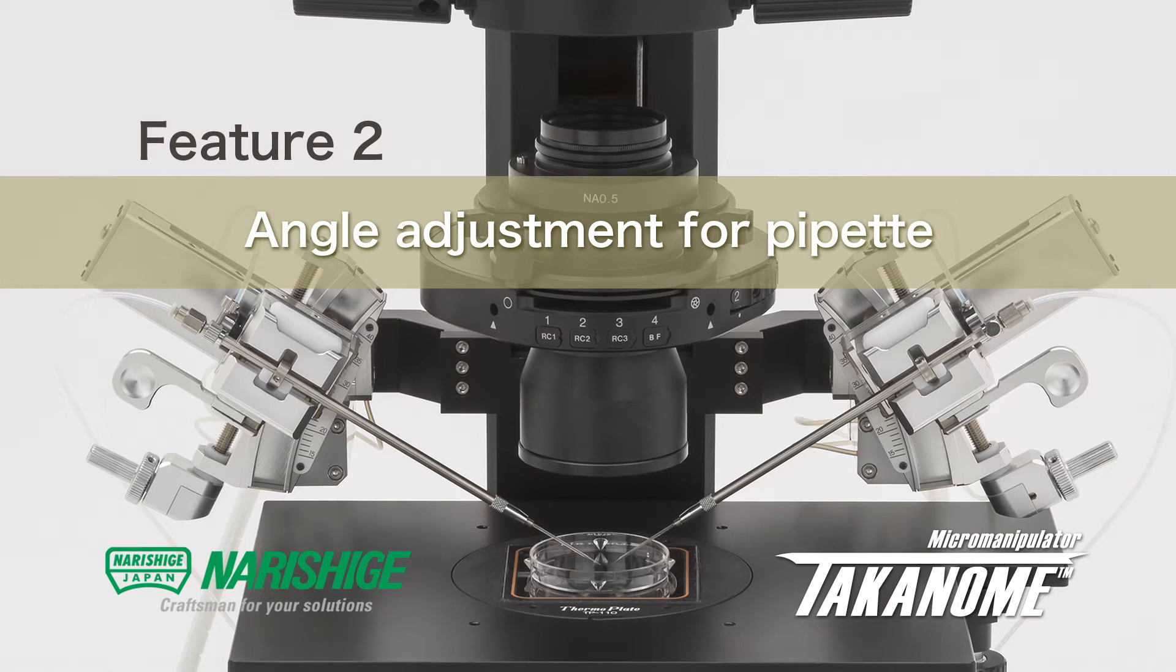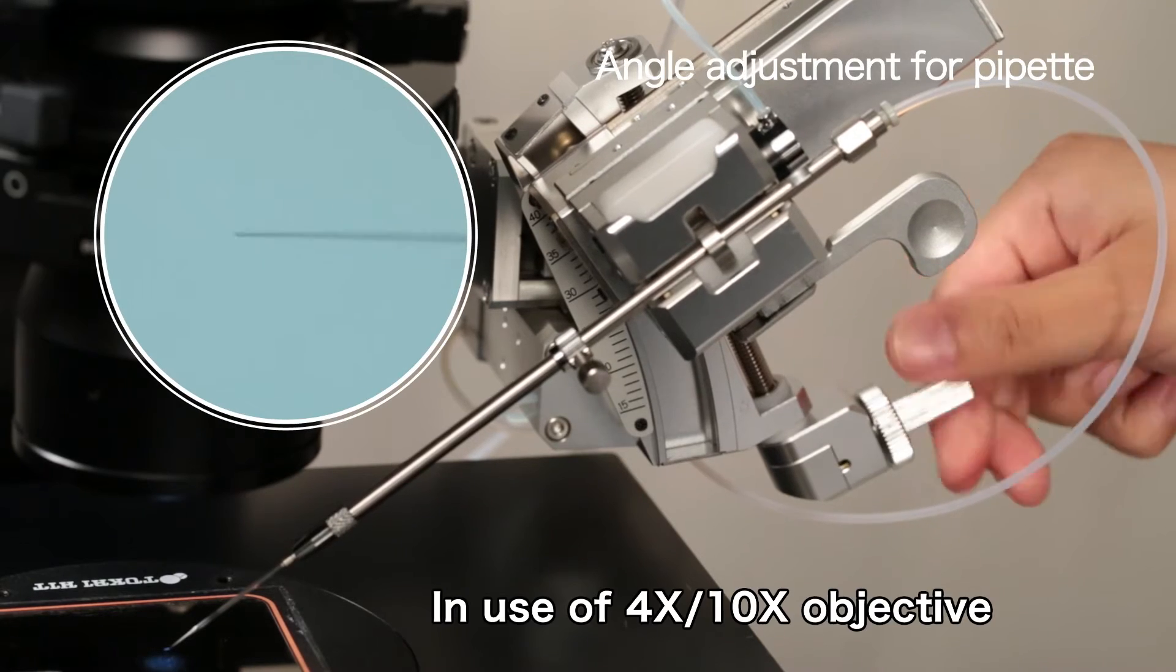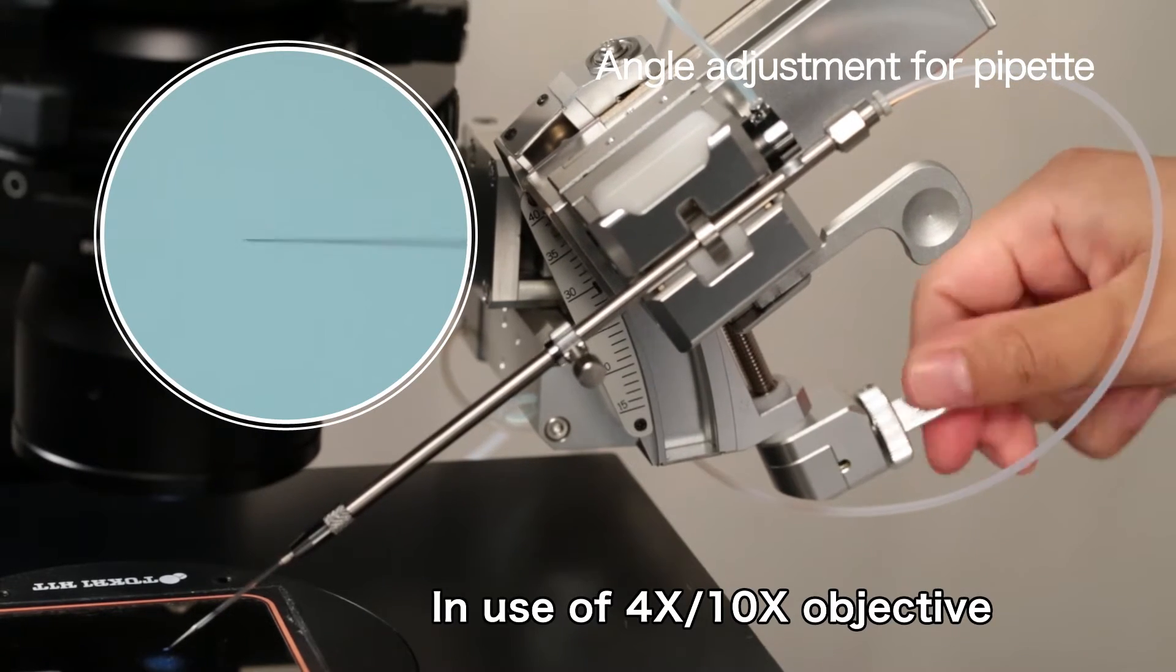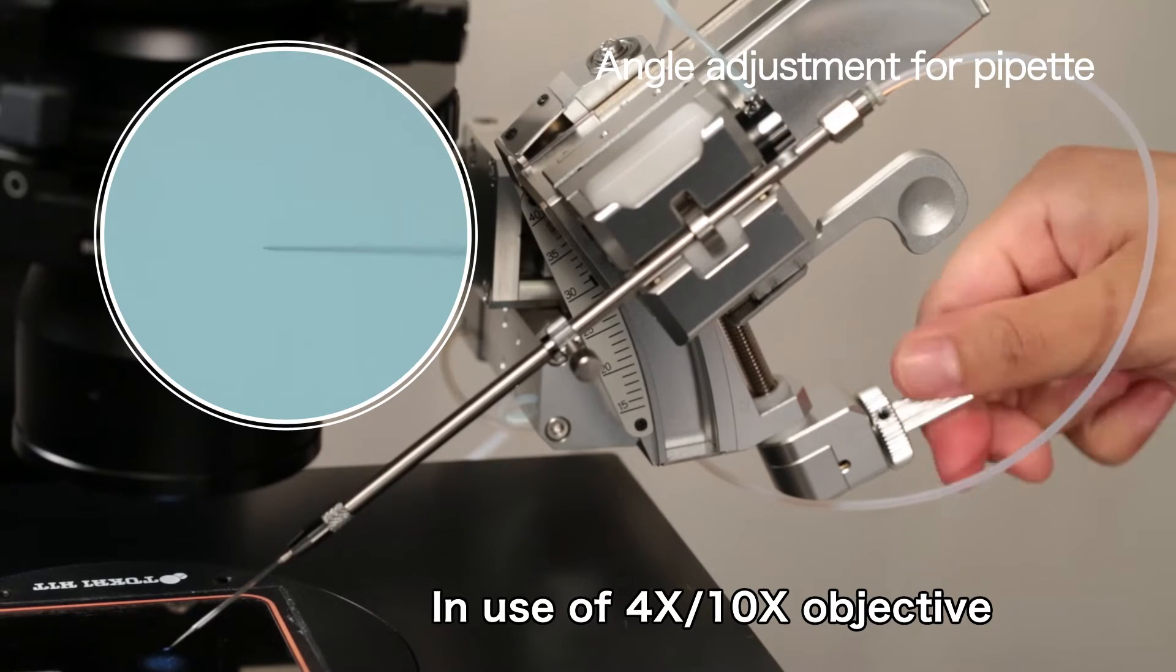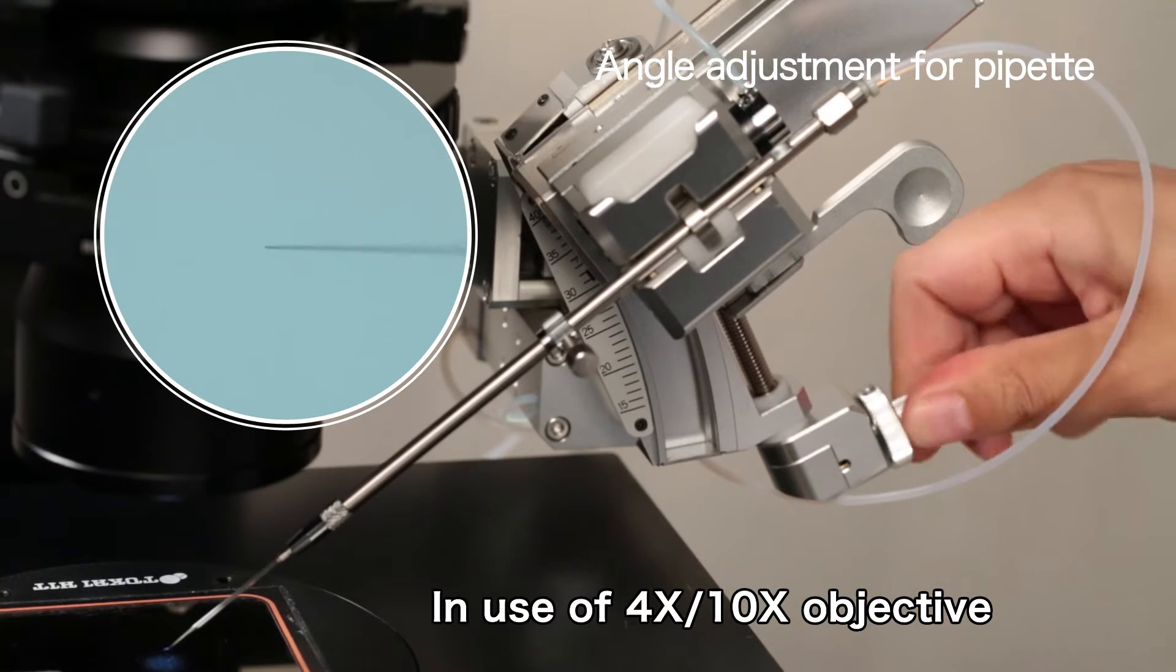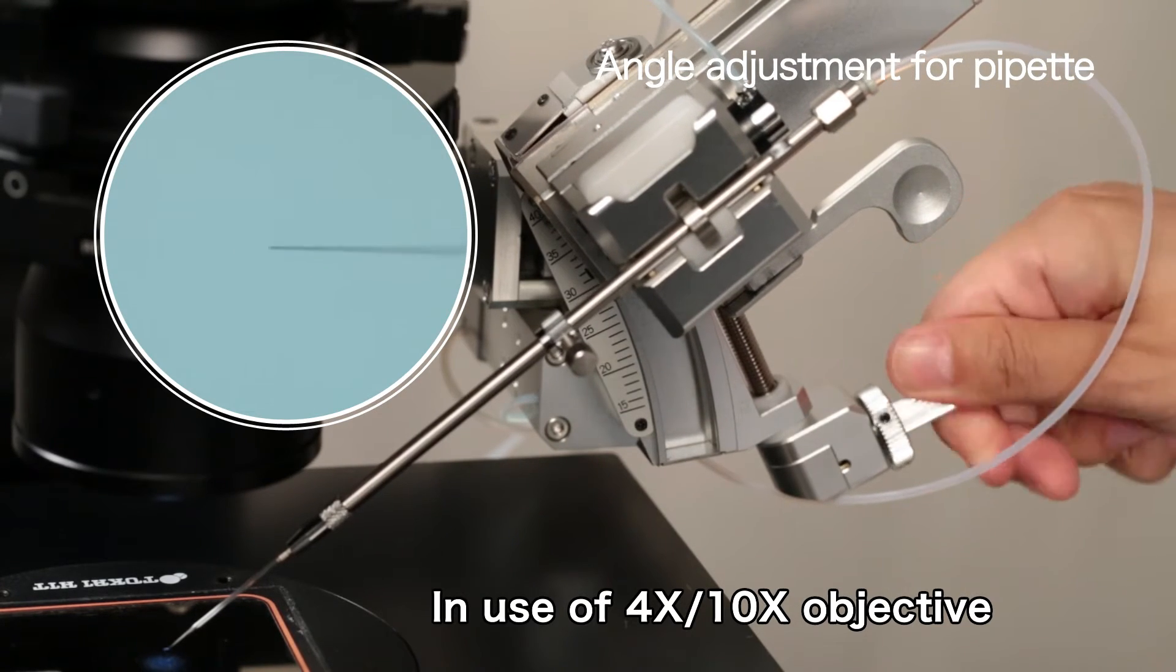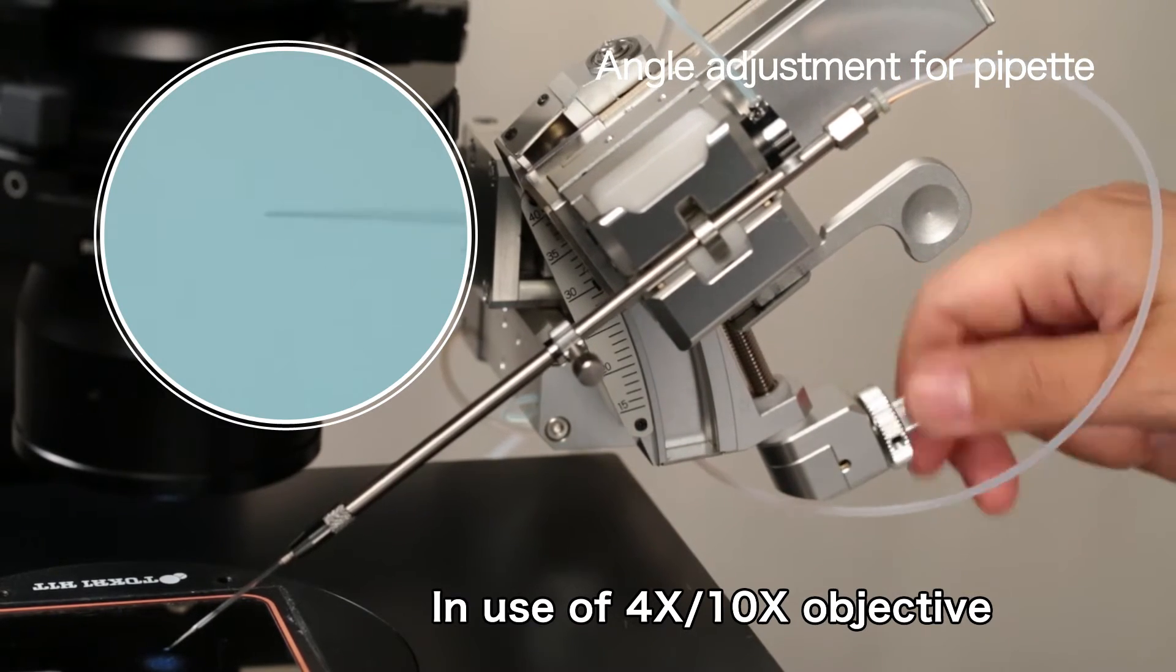Feature 2: revolutionary angle adjustment for pipette. The angle can be adjusted through a wide arc from 15 to 40 degrees. The pipette never leaves your sight, eliminating worries about broken pipettes.